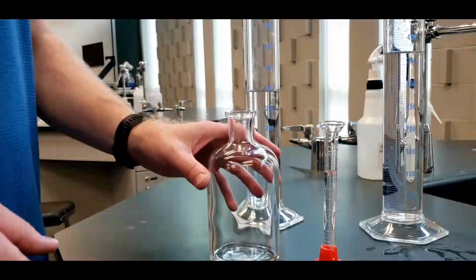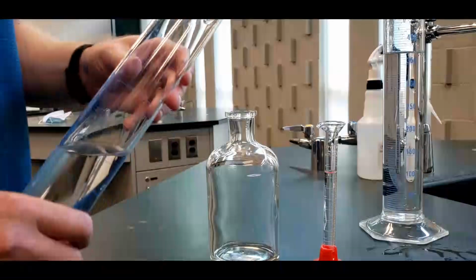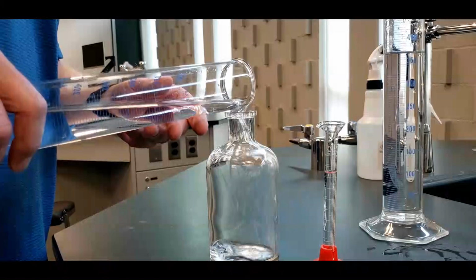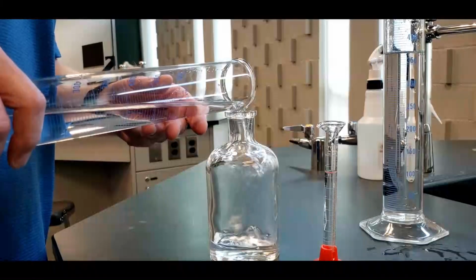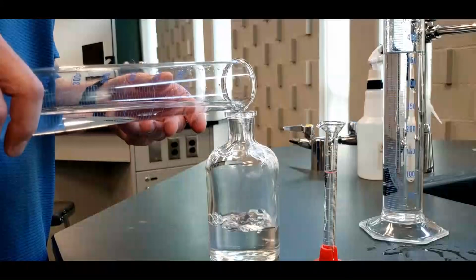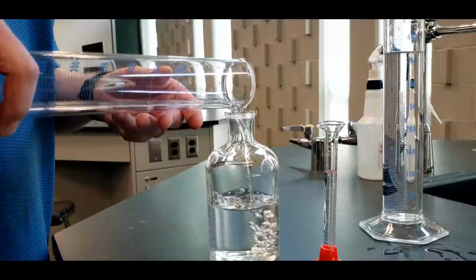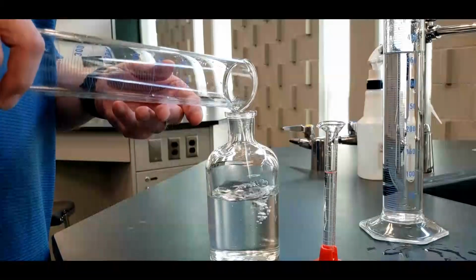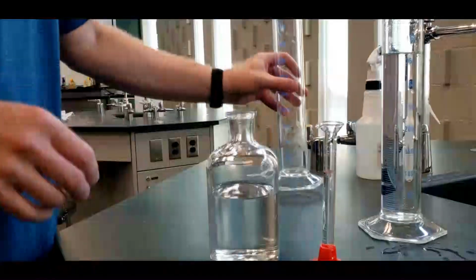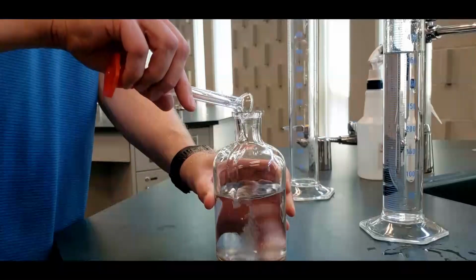But first, let's make the solution here. It says first to add in 300 mils of water. When I'm doing this in the class, I just tell my students add it up to about halfway. The reason we're doing this is so that the mixing of the sodium hydroxide will be easier. If you put the sodium hydroxide in the bottom and then add water, it's not as certain that we're getting a full, complete mix. So put that in there, and then we put in the sodium hydroxide, the 8.3 mils.